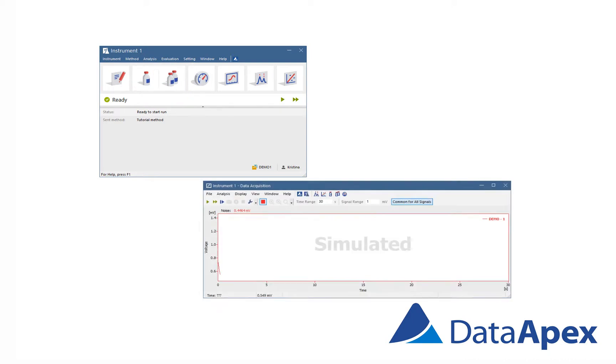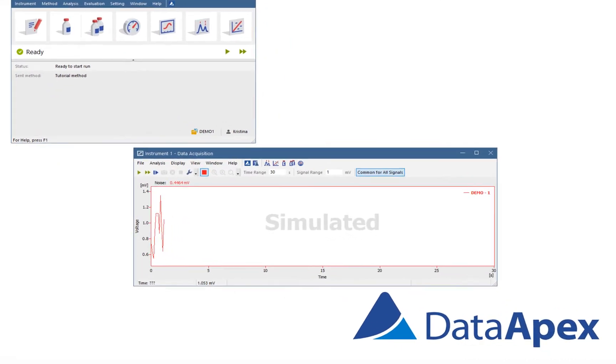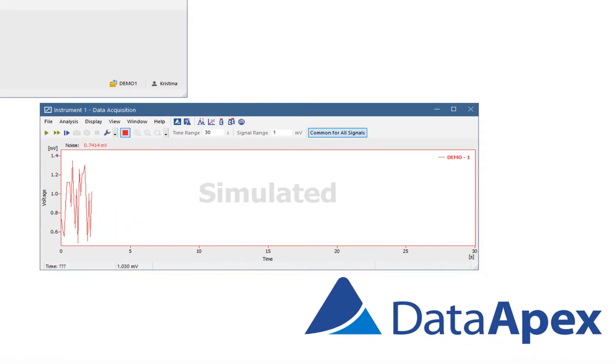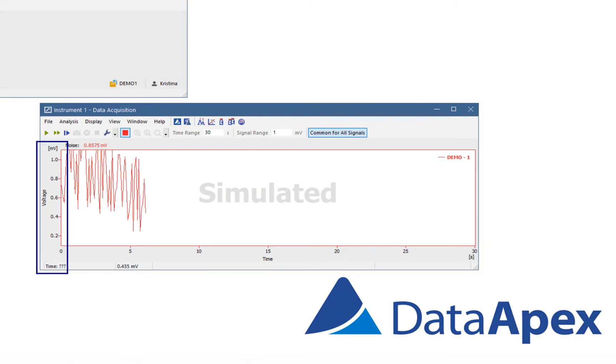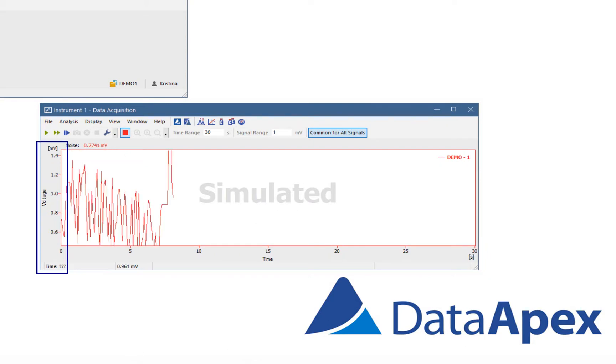The window contains two fundamental parameters: Time, which is on the X axis, and Signal, which is on the Y axis.